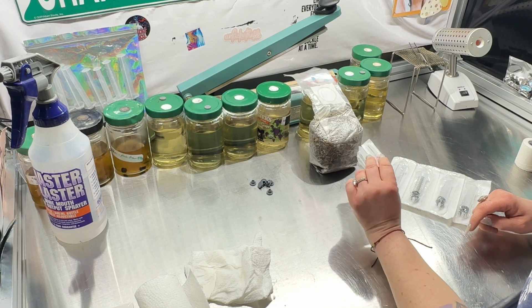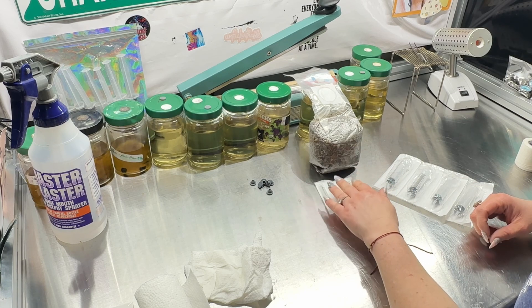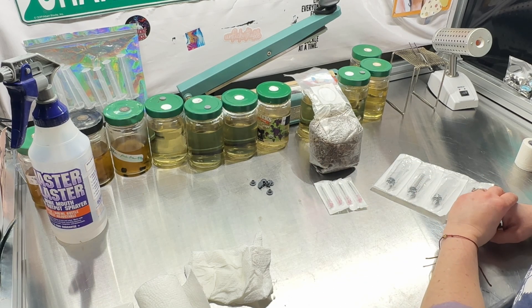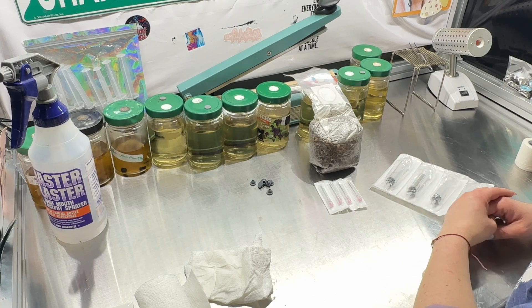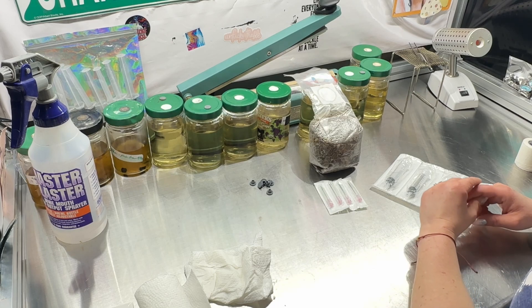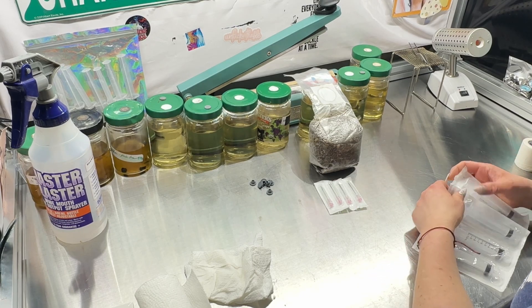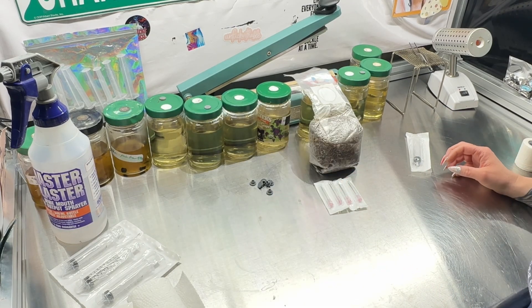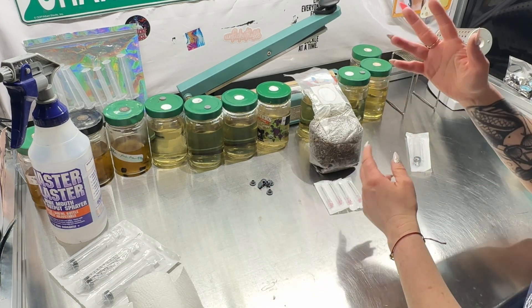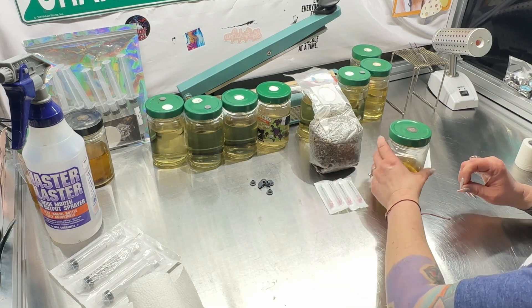It's a metal sharp object — it can easily penetrate through plastic. I'm confused and sad because people are using texts as crutches and not as assistance. A crutch is supposed to help get you started so you can learn things and get the ball rolling. Instead, people believe that there must be an injection port on a bag because it's being sold and the information is being presented that way. I just want to quickly show how to inject without a port — if you must inject. I don't even inject my bags; I just cut the top off and pour straight in. But we'll do the injection right now.